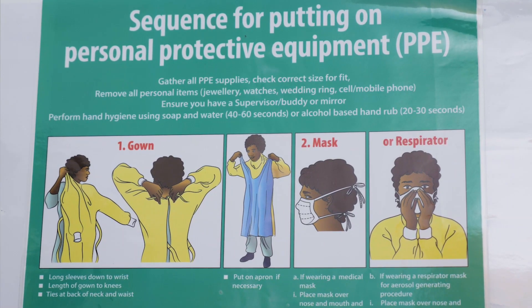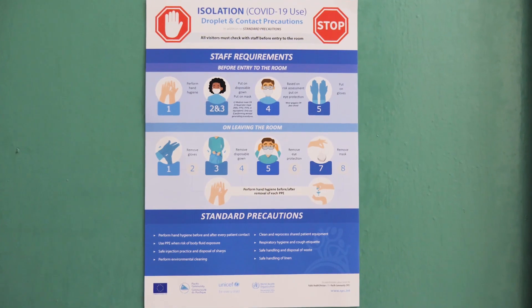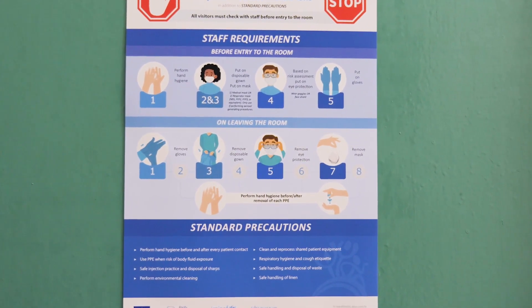The people most at risk are healthcare workers who work in close contact with COVID-19 patients or caregivers caring for people infected with COVID-19. Hence, we made this video to demonstrate the correct steps on how to correctly put on and remove PPE. Let's begin by following the chart on the sequence for putting on PPE and observing the isolation room signage on droplet and contact precautions.